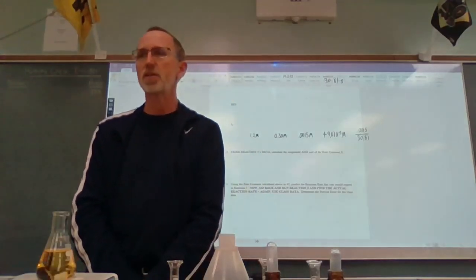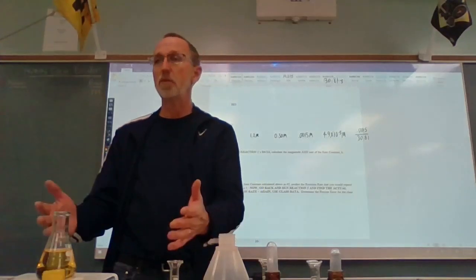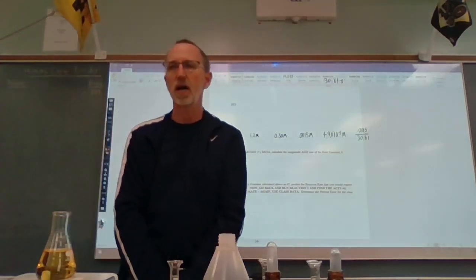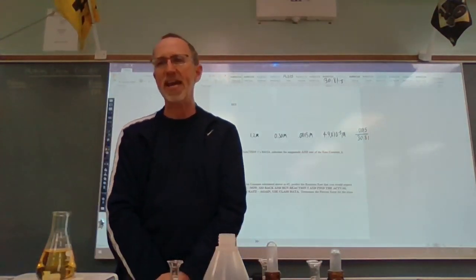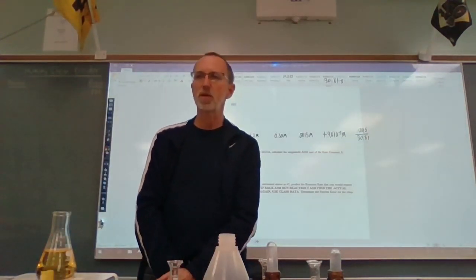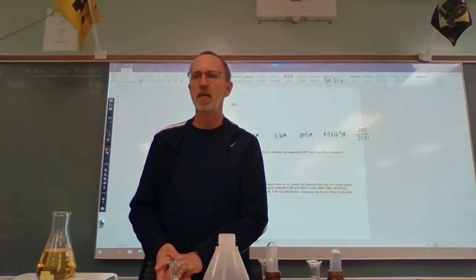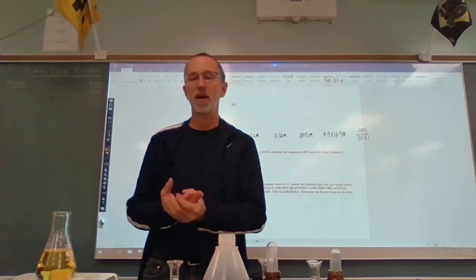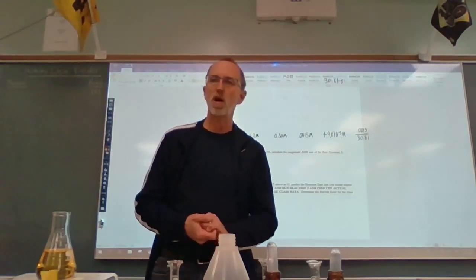From that, determining a rate constant value, and then being able to make a prediction by changing up the concentrations to whatever we want, by making a prediction of a rate based on those new concentrations. And like I said, I hope you'll see that the percent error came out very, very good. So that takes care of Lab 12.1.